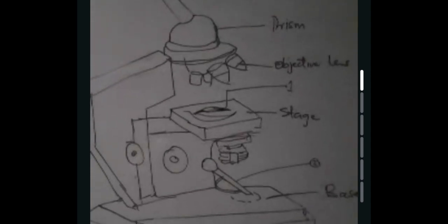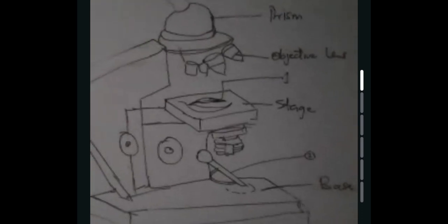The objective lens, since we are having more than one, is there a way you can rule the line to the other so that we capture all the lenses there, like 3 of them? Yes, we rule another line to join it so that we capture either 2 or 3 of them. Now take a good look. 1, 2, maybe 3 of them meet at this point here. Now bring them and label them parallel to each other. So you call them objective lenses.